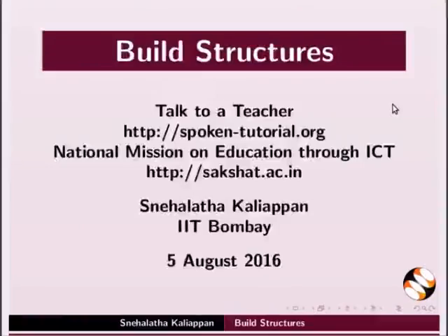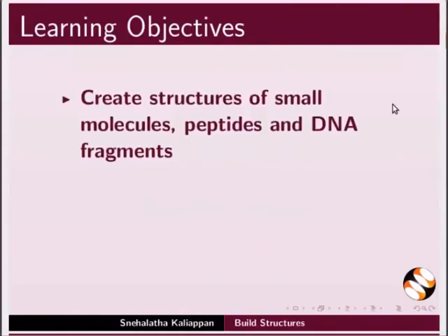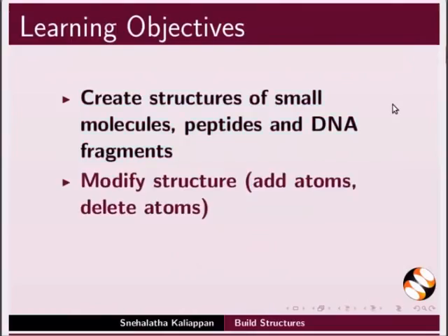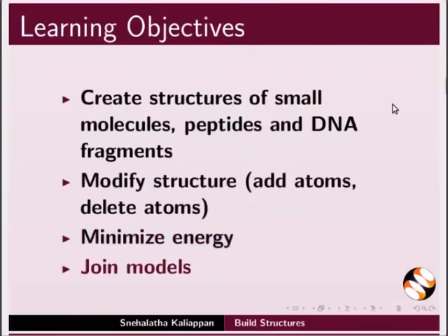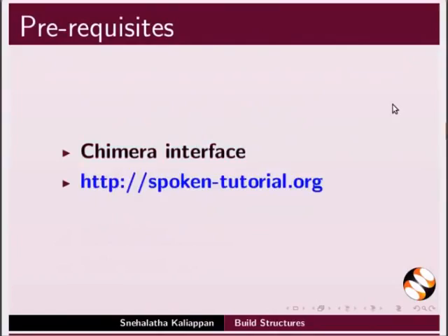Welcome to this tutorial on build structures. In this tutorial, we will learn to create structures of small molecules, peptides and DNA fragments, modify structure, minimize energy and join models. To follow this tutorial, you should be familiar with Chimera interface. If not, for relevant tutorials, please visit our website.